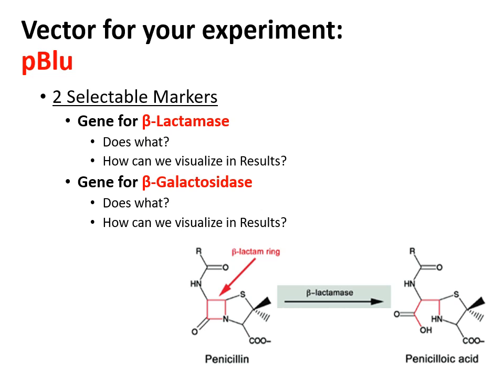If the plate does not have X-gal in it, okay, that means that the bacteria could have all the pBlue it wants in its cells. It will not make anything blue if X-gal is not present, because the blue color comes from beta-galactosidase cutting X-gal in half.